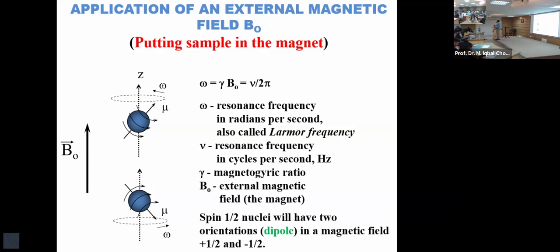That's nice. And the next question is, is this measured for each chemical environment differently, or is it all the same value? That's a very good question. Okay, so in ethanol, classical NMR spectroscopy had three different Larmor frequencies. So radio frequency, exactly like a radio. And I can show you that also. I have a slide.